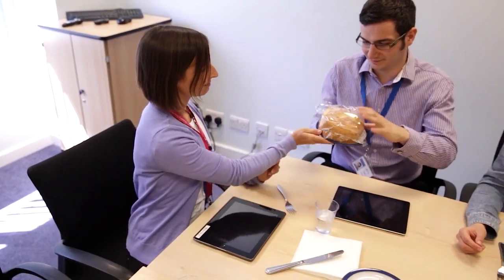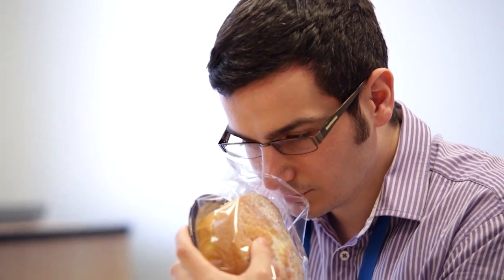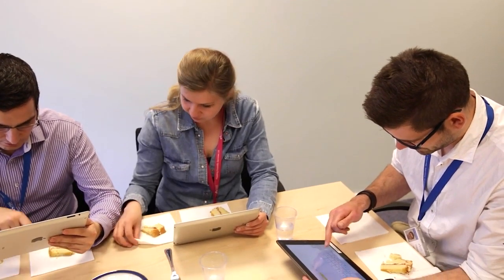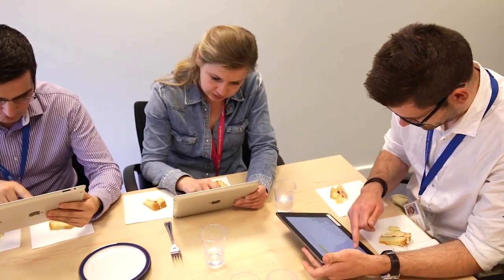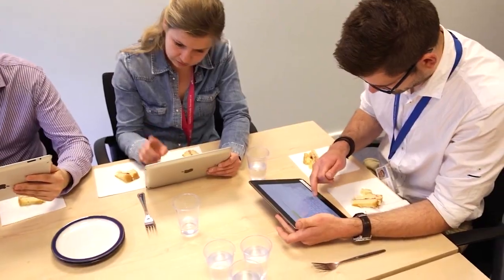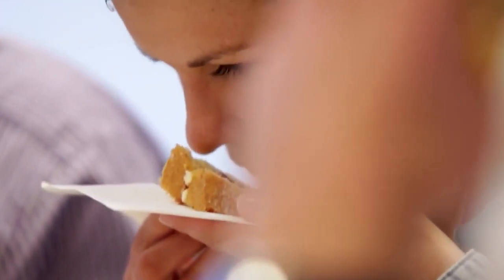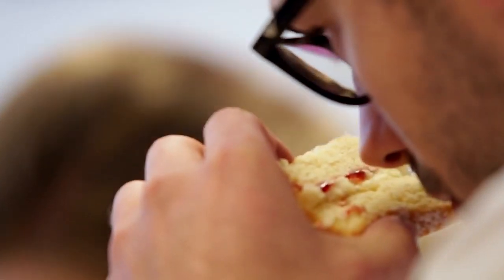Initially, the complaint sample and a reference sample without the taint undergo an informal sensory assessment using our trained taints experts. This gives a good indication as to what the taint might be and the best approach for extraction. In this example, some of our team perceive a medicinal, phenolic and disinfectant-like off-note in the cake. From experience, these descriptors can be associated with halogenated phenols.